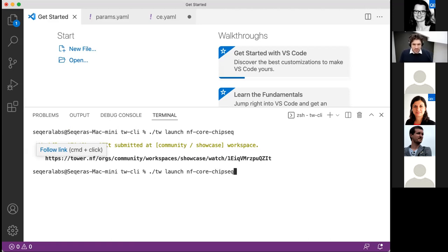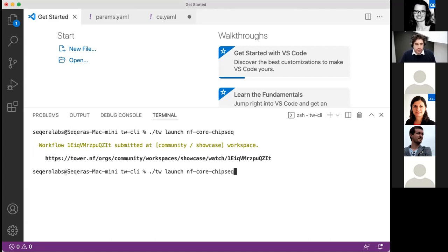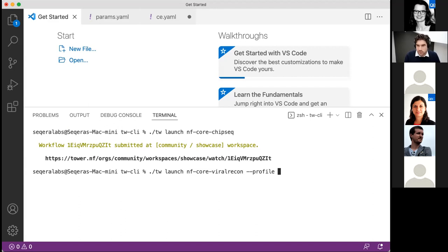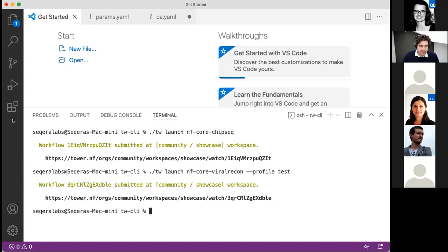That was a basic default launch without changing any parameters. But what if you wanted to run a pipeline where you're actually changing things? You've got a couple of different options. You can define things similarly to the Nextflow command line. For example, I can run the viral recon pipeline from NF-Core and use a test profile — this profile may be some test data or something specific you want to define — using the exact same profiles to launch.